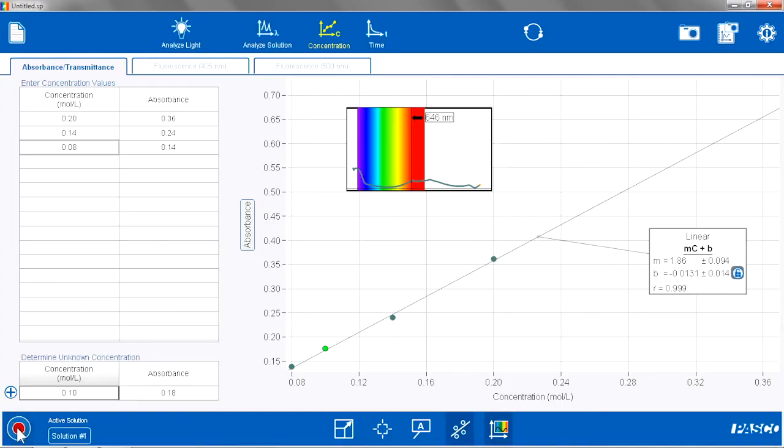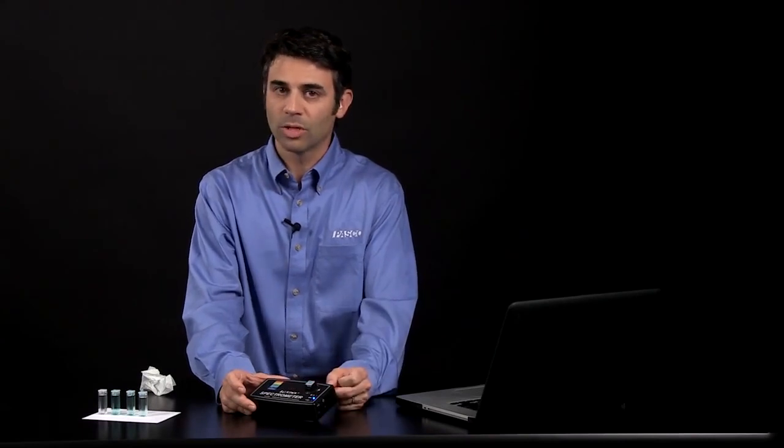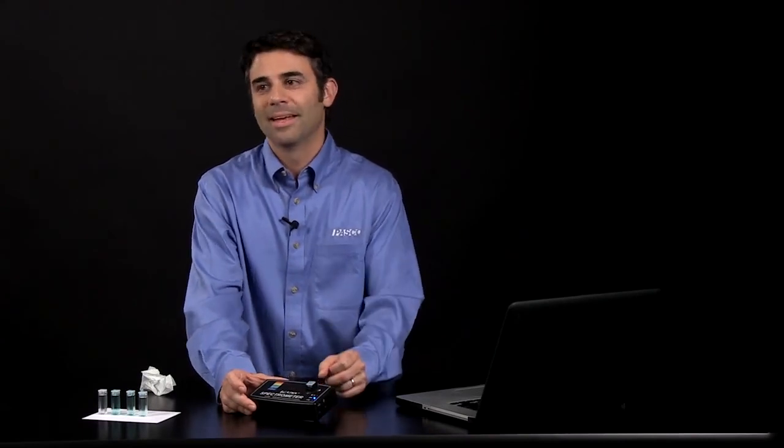So I'm going to stop data collection. This has been doing Beer's Law analysis using the PASCO spectrometer. Thank you very much. This is Tom Lischiavo. If you have any questions or comments, please reach me at chemistry@pasco.com. Thank you.